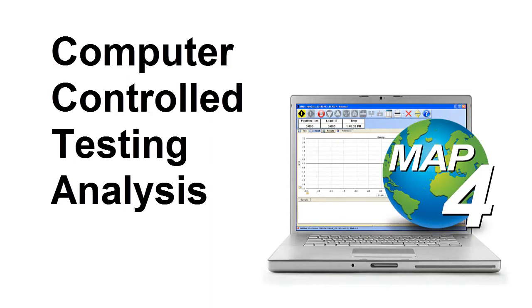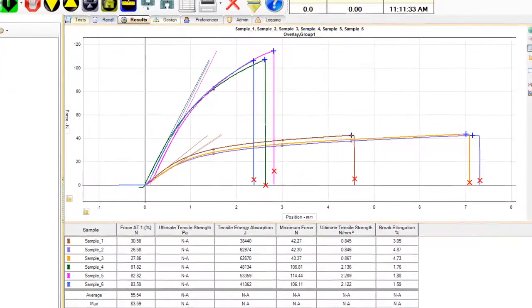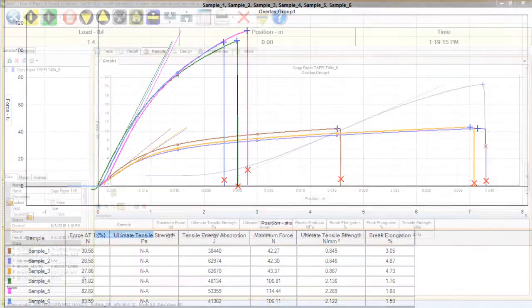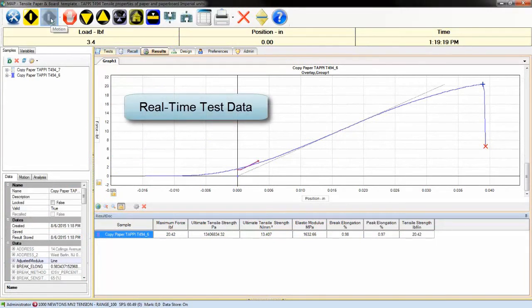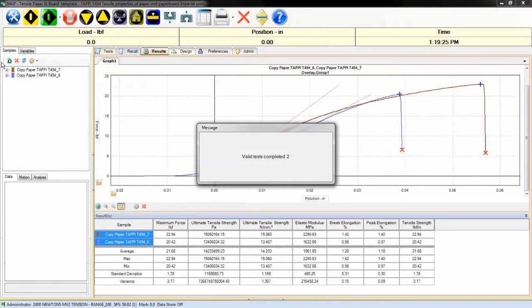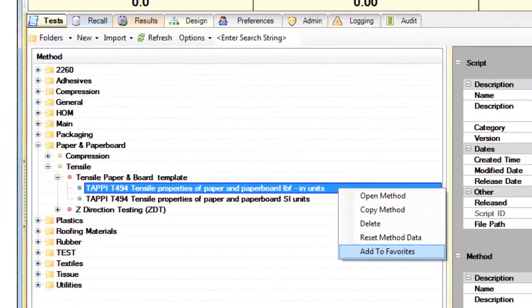Map4 materials testing software is a powerful tool that makes complex analysis and reporting easier. Select and modify standards to set the parameters to run your test and watch real-time test results. With the built-in library of quality standards included, testing capabilities are unlimited with your Vantage NX.